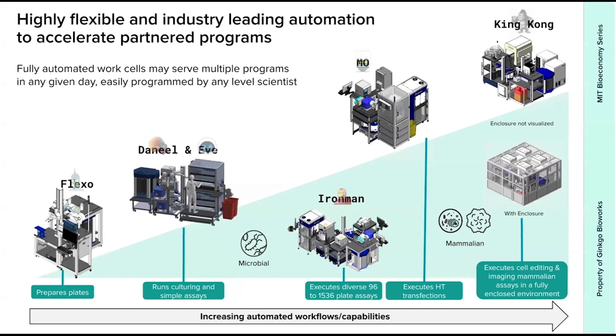And so for us, oftentimes, we could then push the envelope in how we would introduce diversity, be it combinatorial mutagenesis in a library of proteins, looking at combinatorial libraries of regulatory parts for driving gene expression, and running them on these systems at scale.